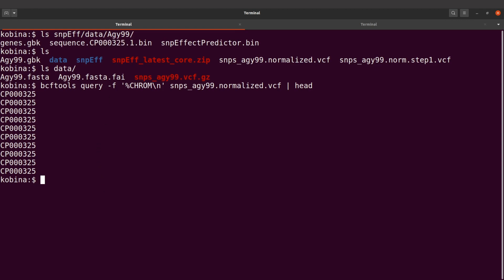So let's first do this. I'll say echo. I don't need to open a text file. I'll just do it here like this. So echo, I'll bring a double quote, and then I'll just copy and paste this. It's just straightforward. I can type, by the way. I just want to copy and paste. I'm feeling lazy right now. So I'll do this, space, and then I'll also copy and paste this one. So notice there's a space in between. So the old name and then the new name.